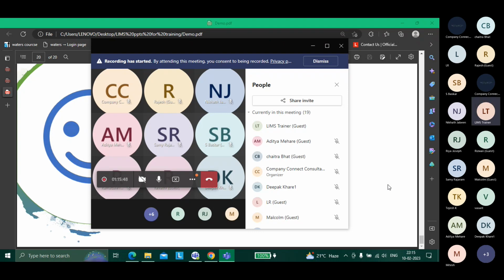SAP LIMS integration, that is a separate, in-depth topic if you want to learn it. Even for that, I also need to learn in much more depth. SAP LIMS integration, right? Two tools are talking. One is SAP having its own coding, scripting. One is LabWare LIMS having its own coding and scripting language. They are talking to each other, so that is complicated, to be very honest.